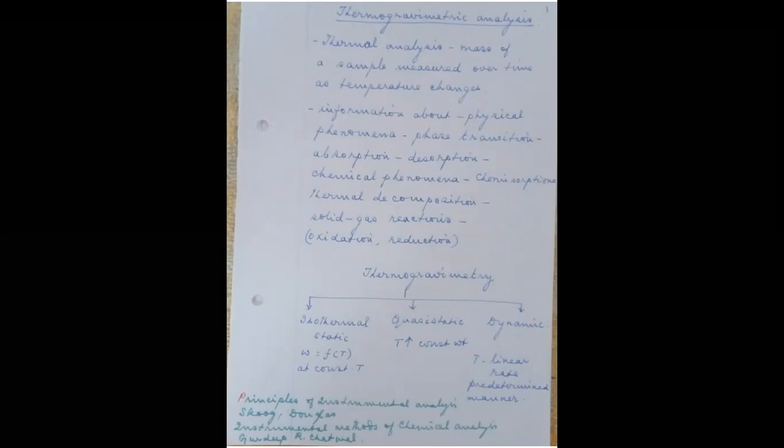And then information about chemical phenomena like chemisorption, thermal decomposition, or solid gas reactions, for example, oxidation and reduction. This information is also obtained from the thermal analysis.